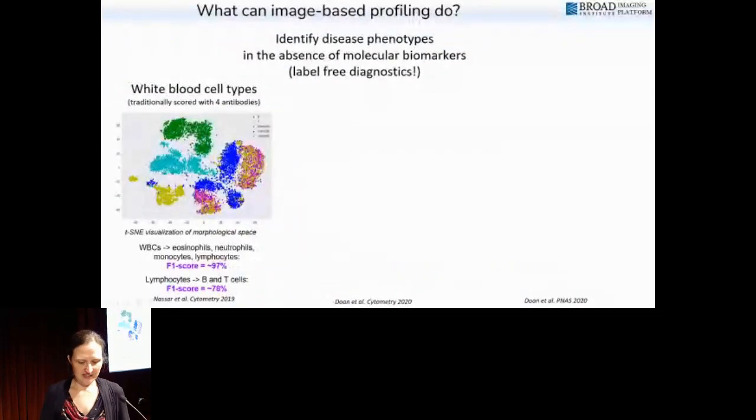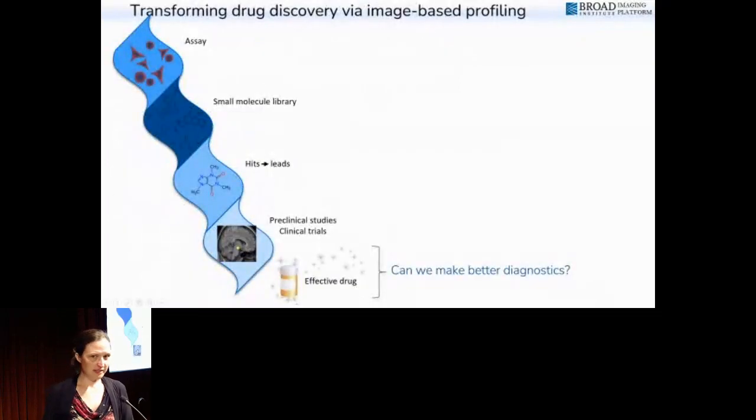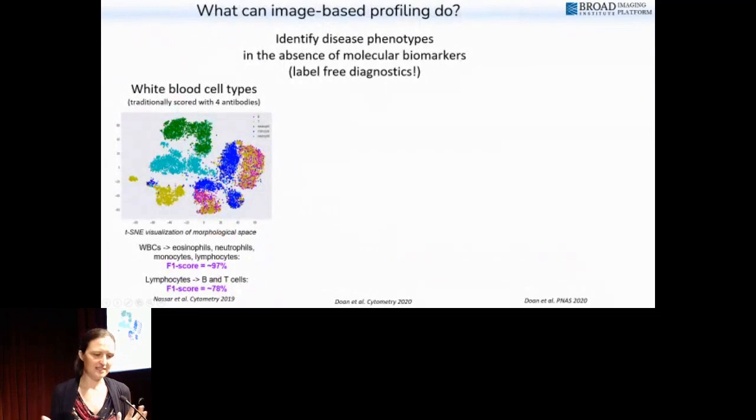All right, so let's go to a different example. The next one is, can we make better diagnostics using image-based output? And for these, just by chance, these are all going to be label-free experiments. So I talked about cell painting with all these fluorescent dyes.